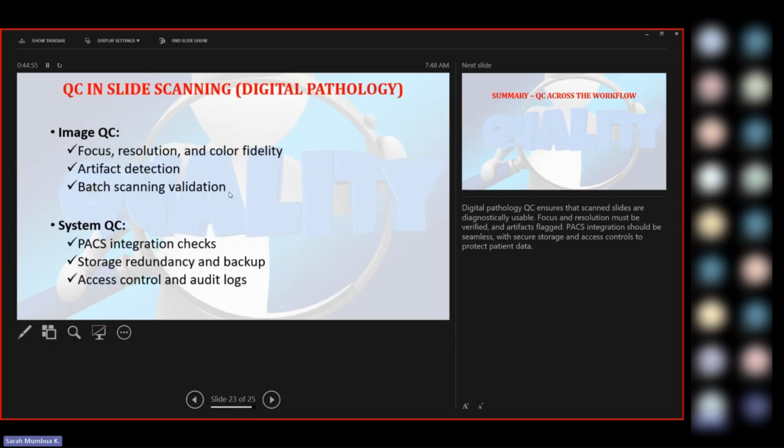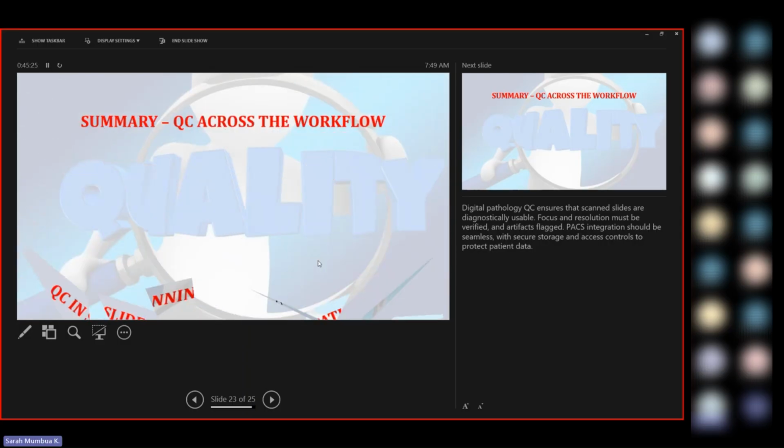If you said, for example, in your lab, you're going to do every 2 weeks, every three months, or whatever time you put, which is standard, and you have an SOP to support your documentation, to support that you're going to dispose the gross tissue within 3 months, that is good to go. As long as you have the blocks intact, because the blocks is what the patient will require for any other thing. If they are sent for a special stain, they are being sent for immunohistochemistry, for second opinions, and that kind of thing. So your blocks have to be kept well.